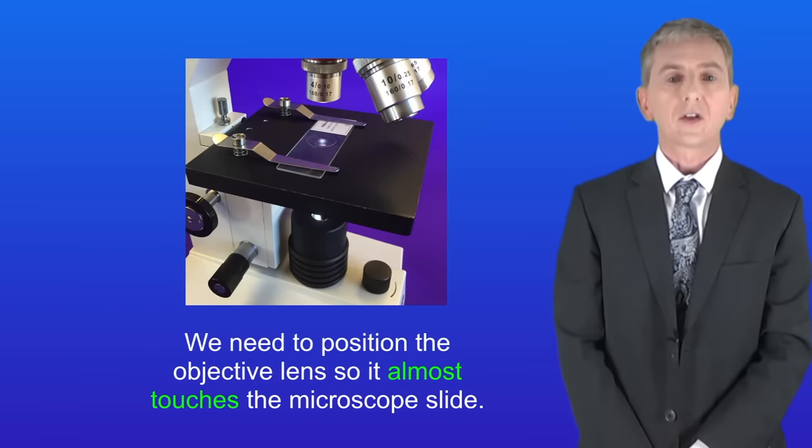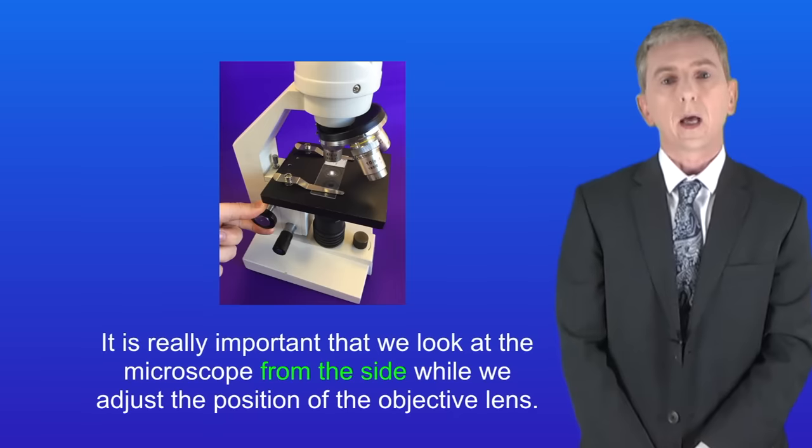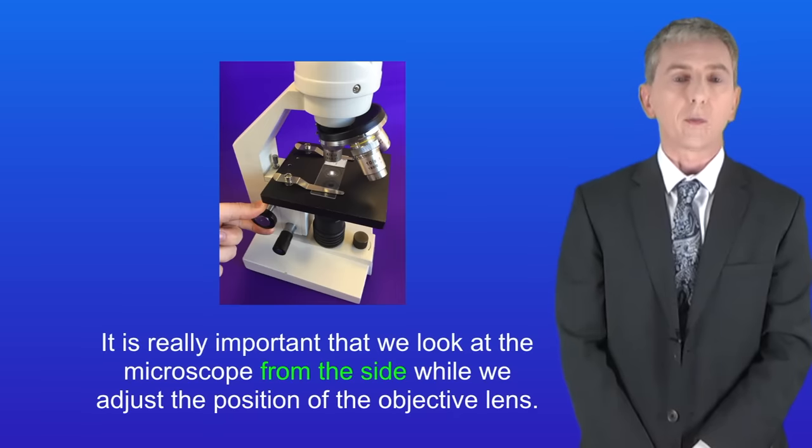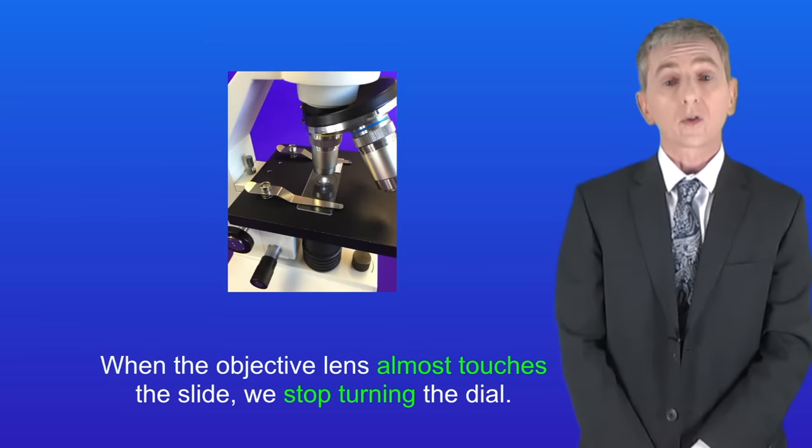We need to position the objective lens so it almost touches the microscope slide. To do that we slowly turn the coarse focusing dial. Now it's really important that we look at the microscope from the side while we adjust the position of the objective lens. When the objective lens almost touches the slide we stop turning the dial.